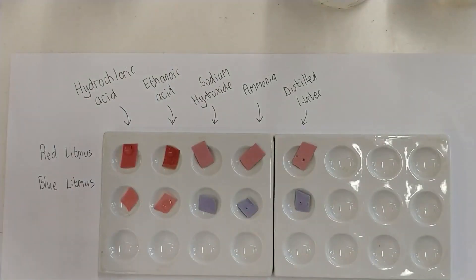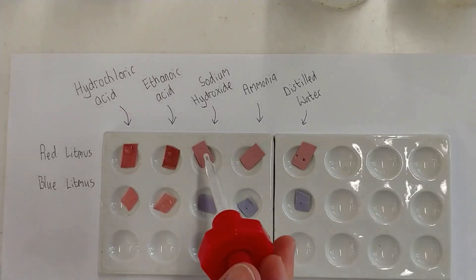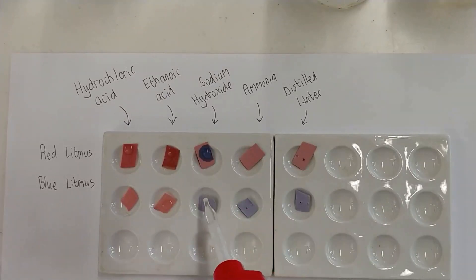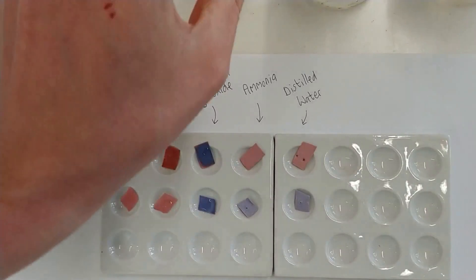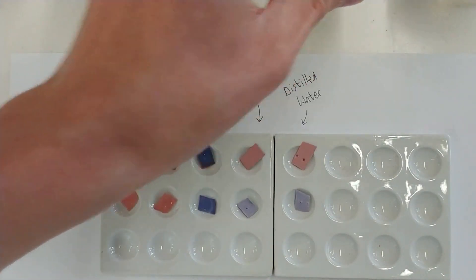Next, sodium hydroxide, another dilute solution. This time we know it's an alkali, so when we drop it on the red litmus, it changes the red litmus blue, and it changes the blue litmus. No, it doesn't change. It remains blue.